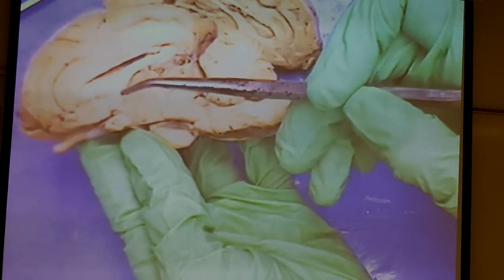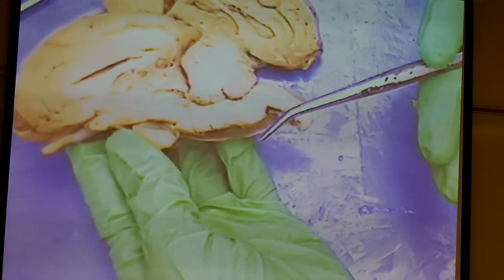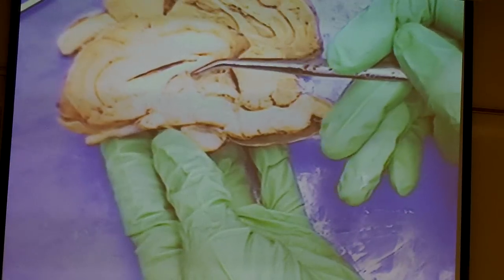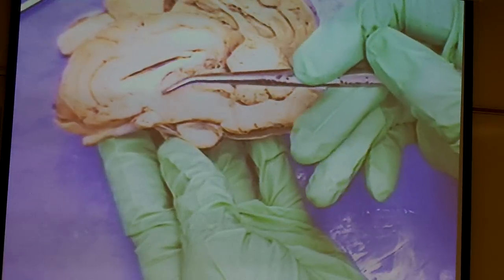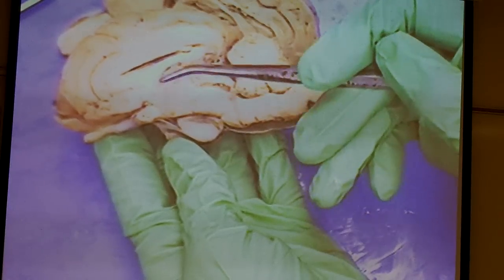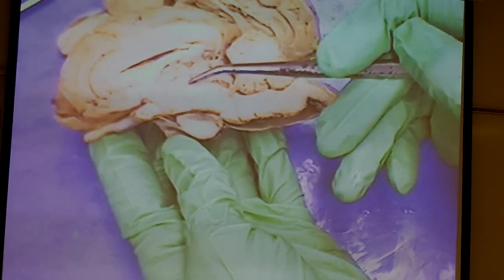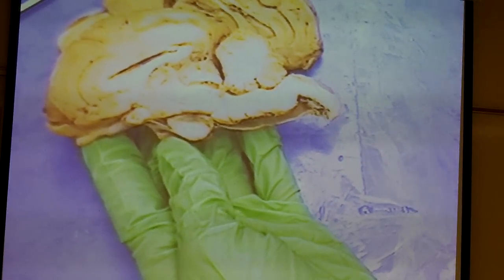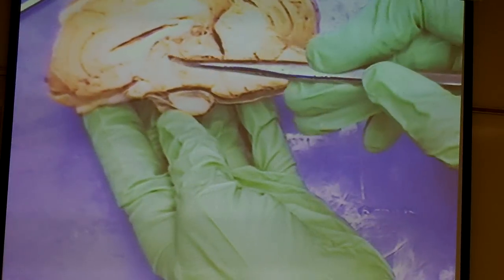Looking more inferiorly, here is a medial view of the optic chiasm. Right below the corpus callosum, this circular-looking structure right above the pituitary — that's the thalamus. That's the routing station, receiving information from different parts of the brain and routing it to the correct destinations.